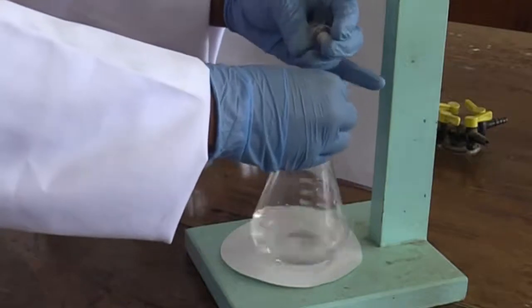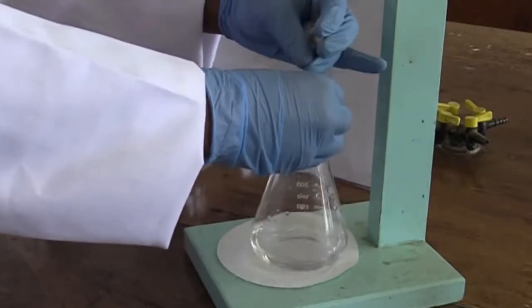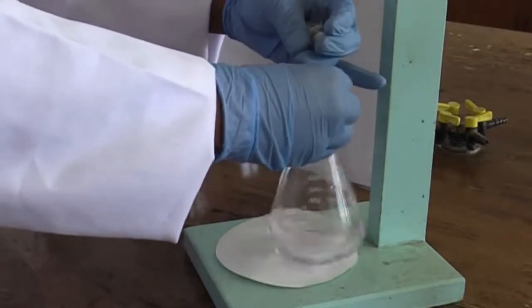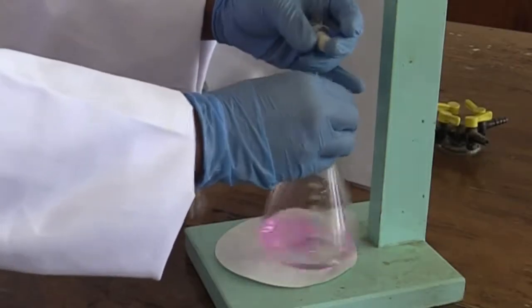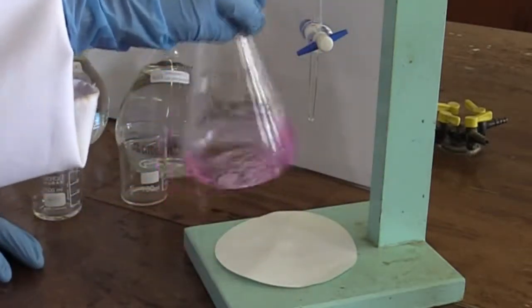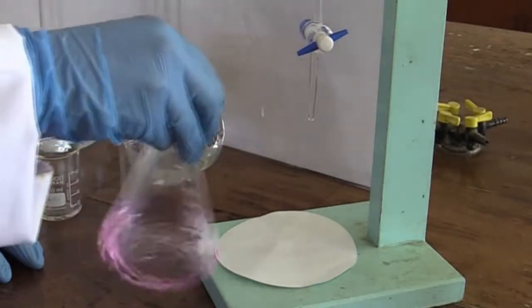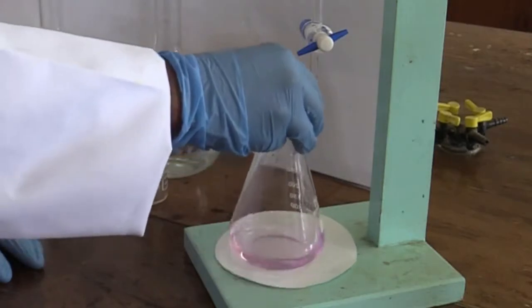The endpoint occurs when a pale pink solution has formed. The solution cannot be too dark after titrating. This is what we call overshooting the titration, and it will result in an inaccurate concentration. You have to be very careful, as you can see, but we have reached the endpoint and we can now read the final volume to calculate the concentration. We do this twice more and then we are ready to calculate.